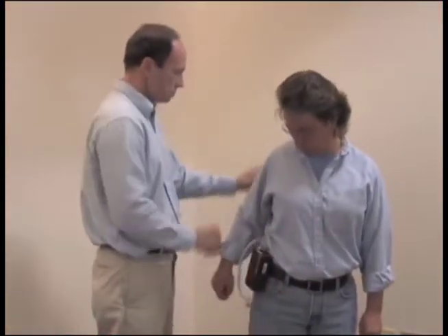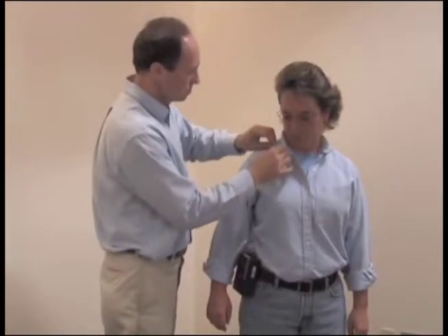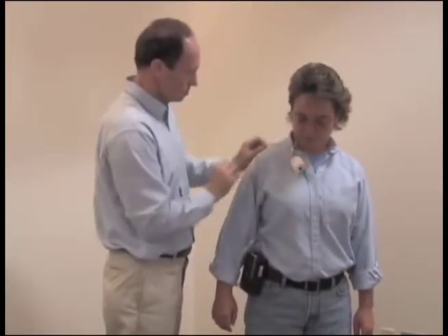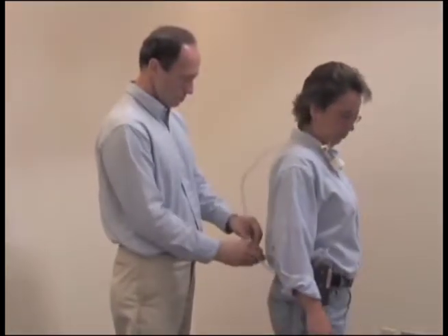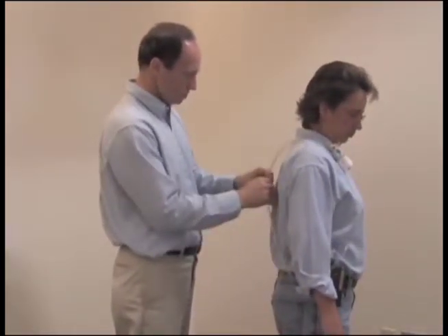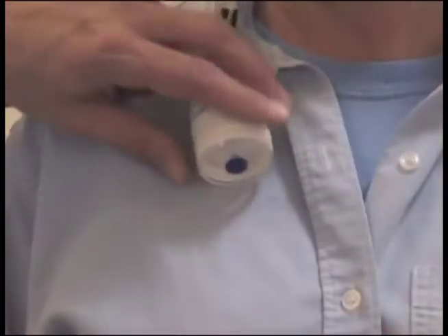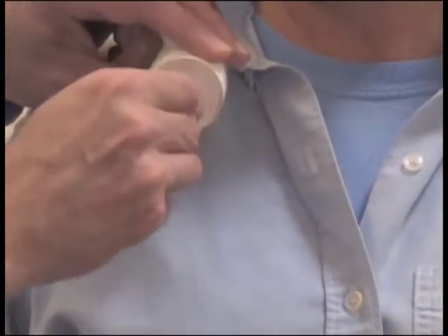Attach the pump to the worker's belt or pocket, either in back or on the side. Bring the tubing around to the front. Attach the sample to the shirt collar in the breathing zone. Use the collar clip to attach the tubing in place along the shirt to restrict its movement. Remove the nib from the inlet side of the filter cassette.